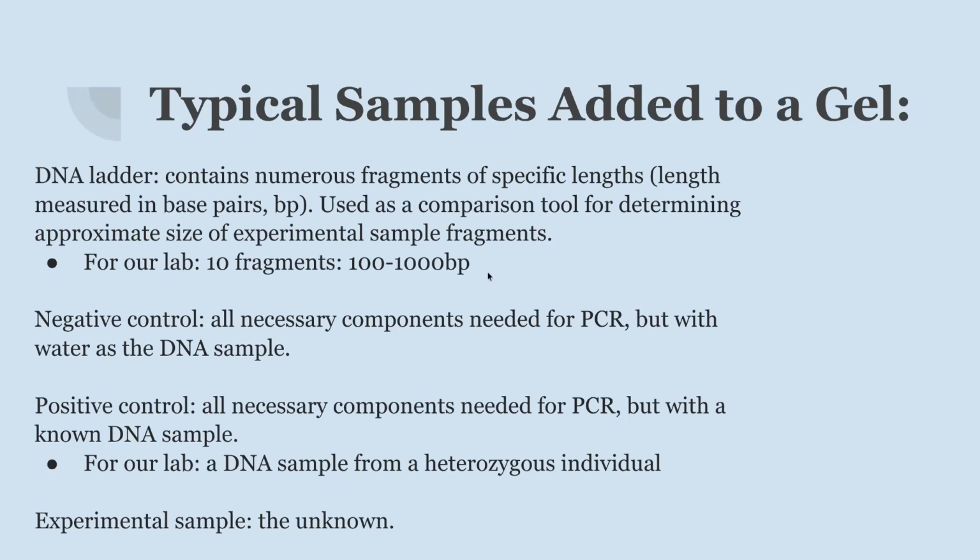The negative control, and this is going to be all necessary components needed for PCR, but with water as the DNA sample. Why would that be a negative control?